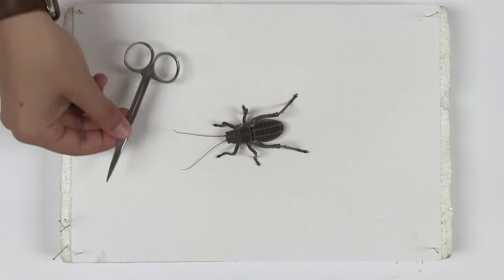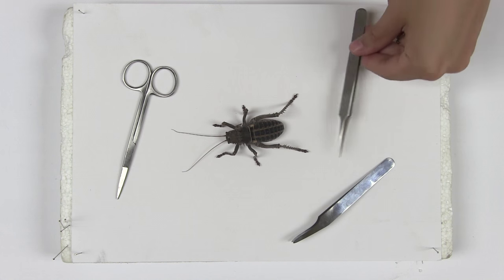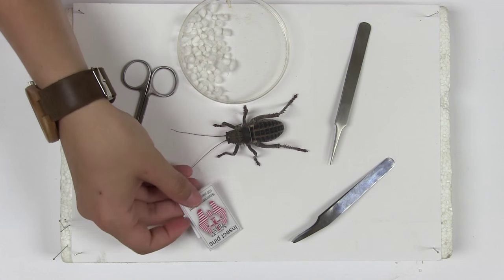The equipment you will need is scissors, soft larval forceps or a spatula, fine tipped forceps, very small cotton wool balls, foot powder and insect pins.